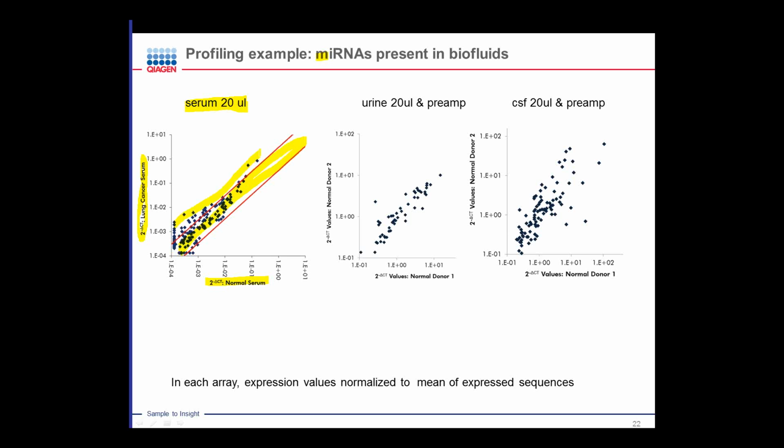There are some that are overexpressed. And the ones that are mostly overexpressed here, in fact, have been previously reported in the literature as being overexpressed in the solid tumor. So even in this very, very basic experiment, you can find microRNAs that are known in the literature to be overexpressed in the tumor, that are in circulation and at aberrantly high levels.